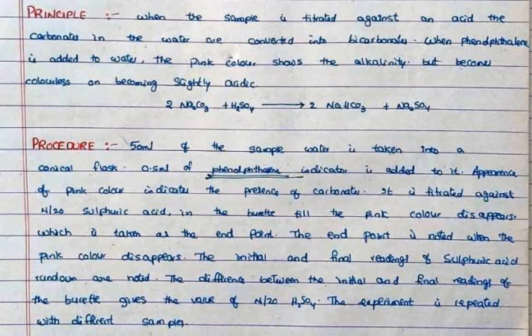The initial and final readings of sulfuric acid are noted.